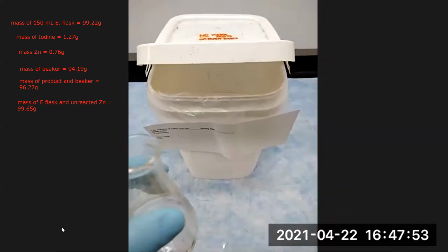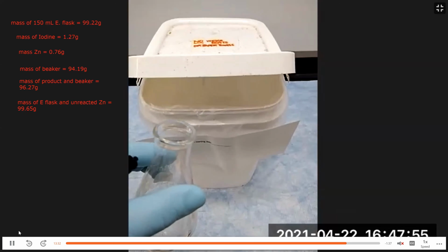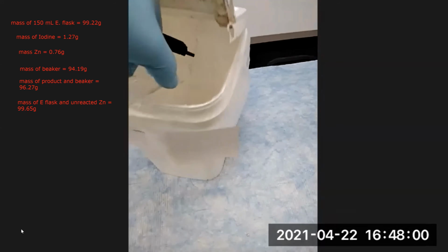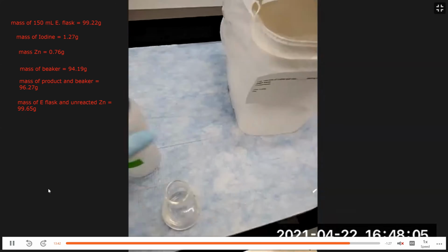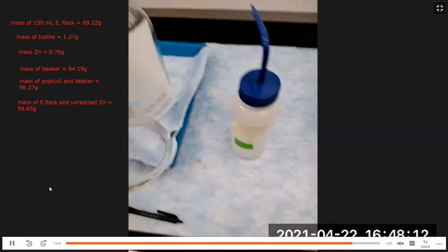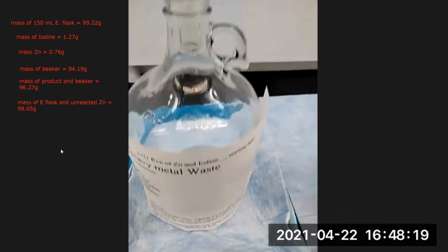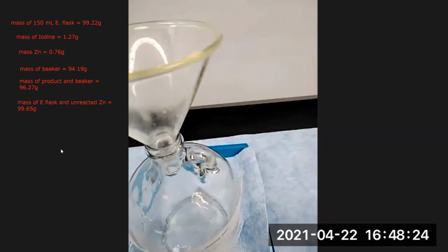Very important, make sure you put the unreacted zinc into the solid waste container. We pour it out of the Erlenmeyer flask into the solid waste container. You can rinse the flask with a little water and put that in the aqueous waste. Only the solutions and washings go into the glass jar.